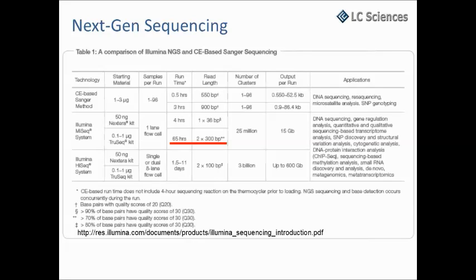That's a lot of reads for 16S rRNA gene sequencing. So the data output will be 15 gigabases. The runtime for the whole paired end 2 multiply 300 base pair length will be 65 hours. That's probably close to 3 days.